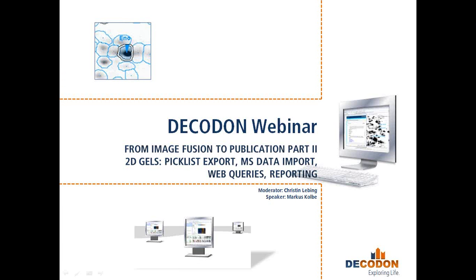Welcome to the DECODON webinar, part 2 of the webinar from image fusion to publication. Today we will talk about how to export pick lists from 2D gels, how to re-import mass spec data, to run web queries, and how to report results.